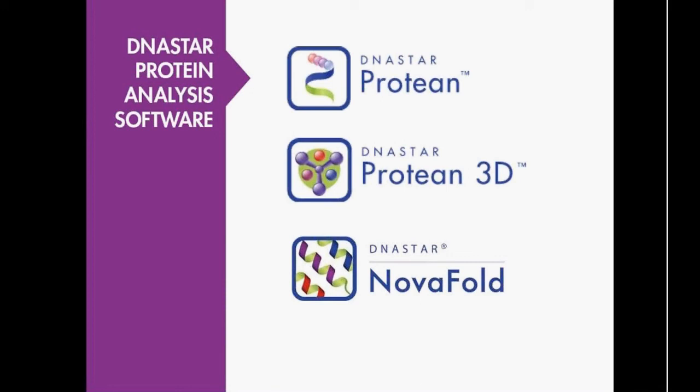Now with the introduction of NovaFold, we have shifted our historical licensing model as a company. Traditionally, all DNASTAR software was purchased as a perpetual license. However, with the introduction of the DNASTAR Cloud in our Lasergene 11 release a few months back, and the introduction of NovaFold, we now offer more flexible licensing options customizable to your particular project. Now, you have the option to set up annual licenses or licenses by month, week, or individual NovaFold structure prediction. Our sales representatives are happy to talk to you about your specific research and set up a license plan that's customized to your particular needs.